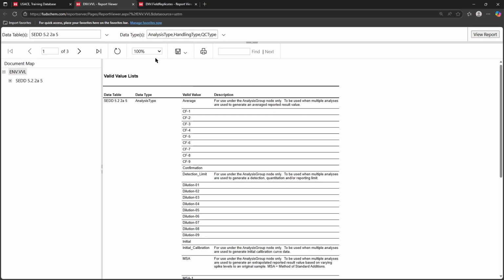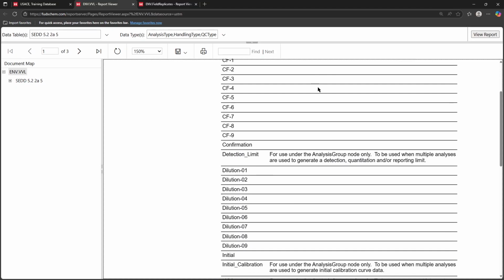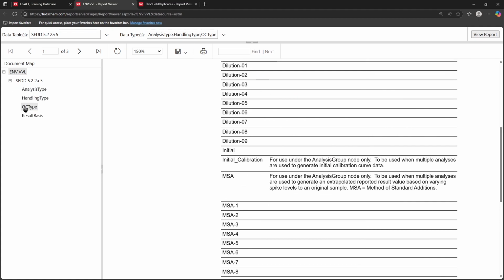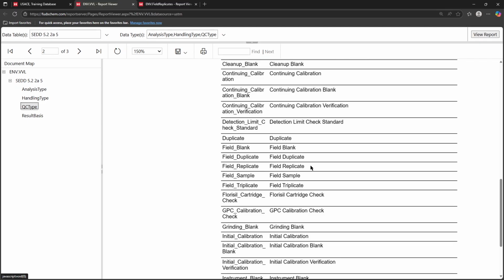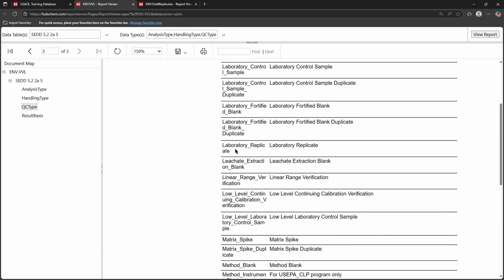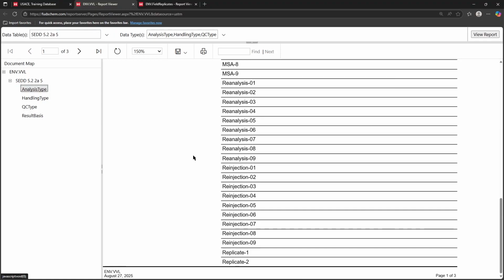Typically, ISM samples will be sent to the lab in replicate. All replicates should be assigned the QC type of field replicate. Laboratory replicates assess the precision of the laboratory sample processing procedure and sample representativeness. The QC type for these additional samples is laboratory replicate. Laboratory replicates can be distinguished by an analysis type of replicate number, where the number is recommended to be 3 or more.